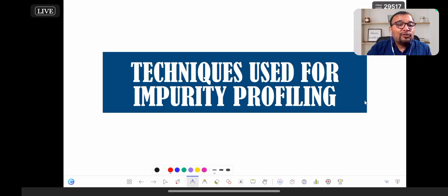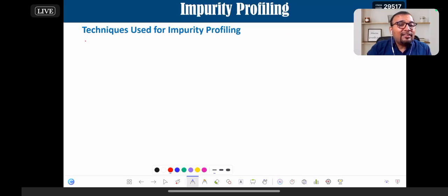So what are the techniques used for impurity profiling? Now, there are some techniques which may be required or may not be required. I try to comprehensively cover all the techniques, but based on the need of the molecule, one can exclude some technique or you can add some other technique.